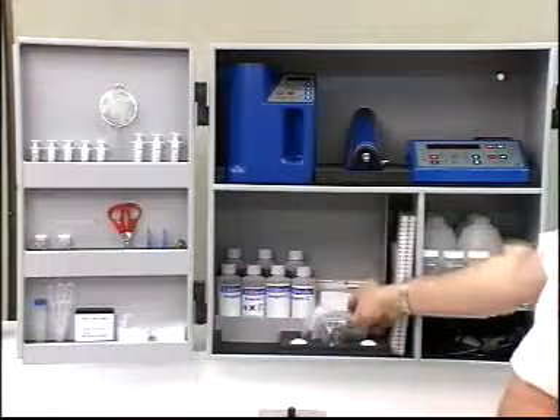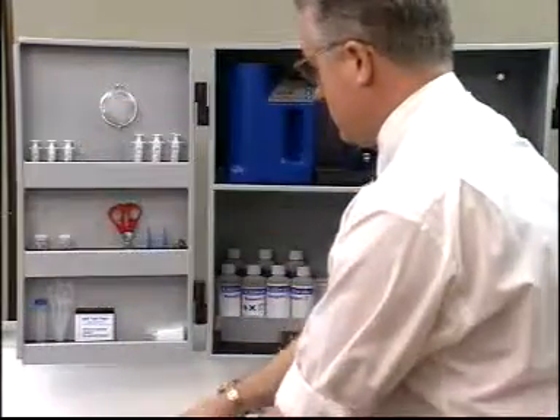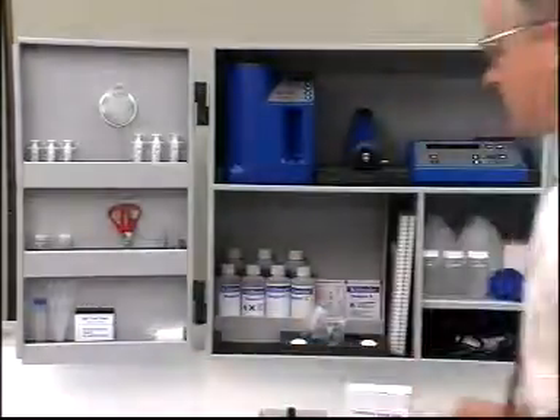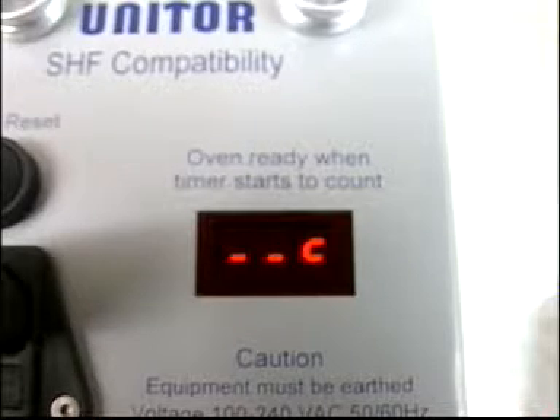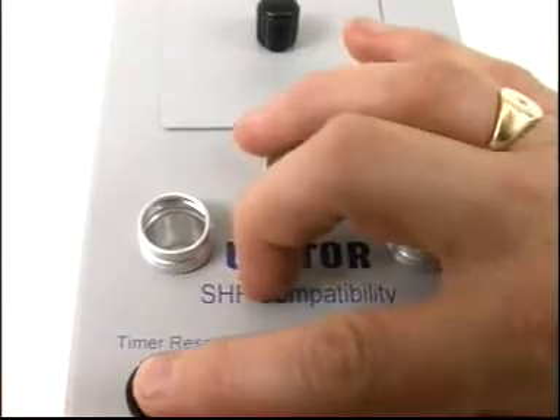This section shows you how to test the stability of a fuel sample and how this can be used to test the compatibility of two fuels. The compatibility test unit is fitted with a timer. When the equipment is heating and not yet ready, it looks like this. When fully heated, the timer counts in minutes from 0 to 99 and can be reset by pressing the reset button.